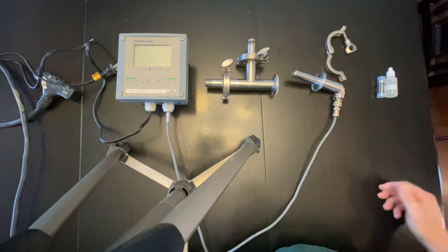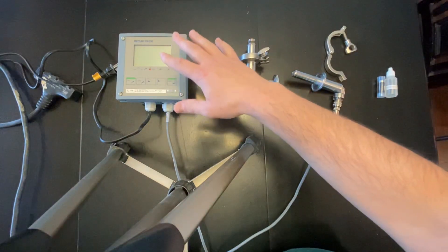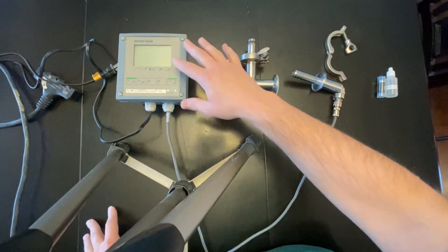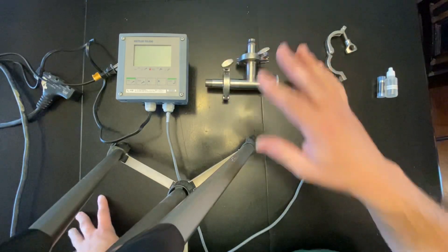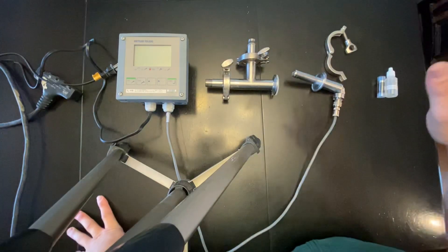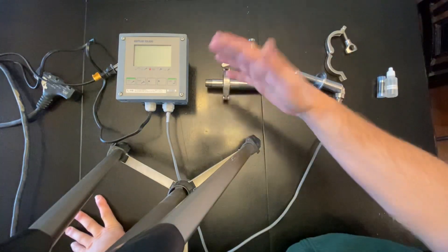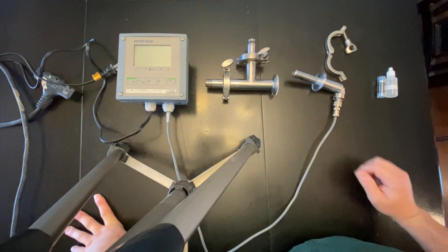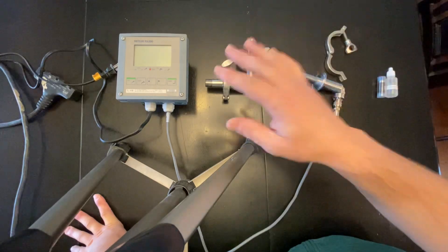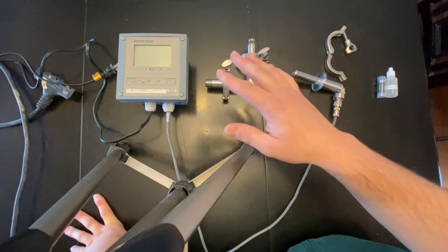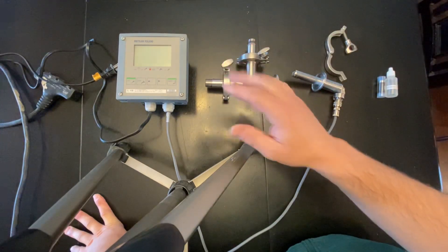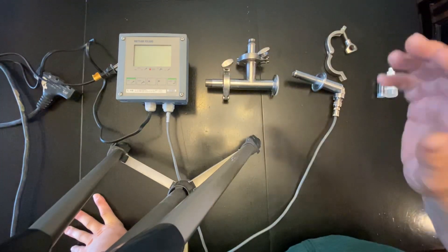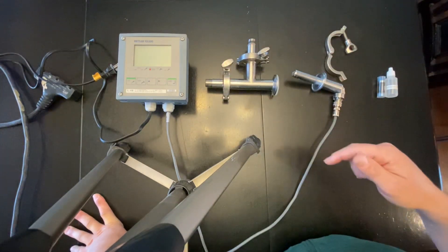Over on the Mettler Toledo unit, you shouldn't have to mess with any connections or anything like that, but in another video I will show you how to calibrate this because you will need to calibrate it every time you get it.